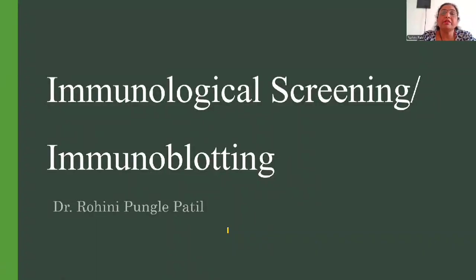Welcome. We have come across the blotting techniques like the southern blot, western blot, northern blot, and we have also seen colony hybridization, plaque lift assay, dot blot, and slot blot. Now, today's video is about immunological screening, or immunoblotting.